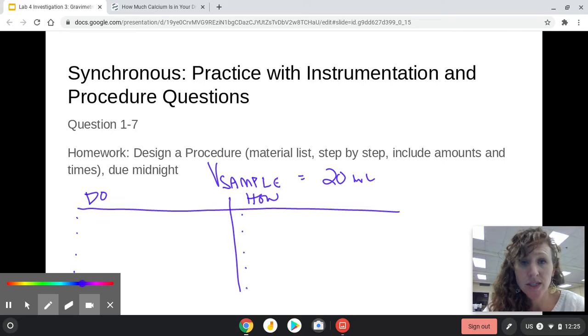Another approach you could take is trying this experiment with a couple different trials. You could kind of do something similar to what we do when we're heating the water off of the filter paper. You could run a trial where you mix in 0.5 grams of sodium carbonate. And then you could run a second trial where you mix in a whole gram. And then a third trial where you mix in 1.5 grams.